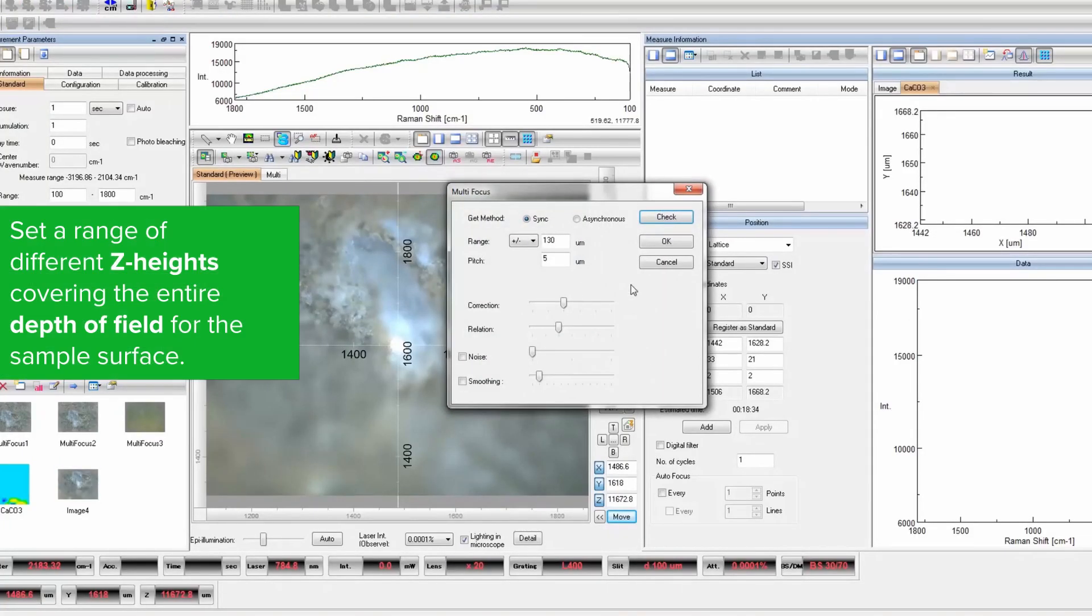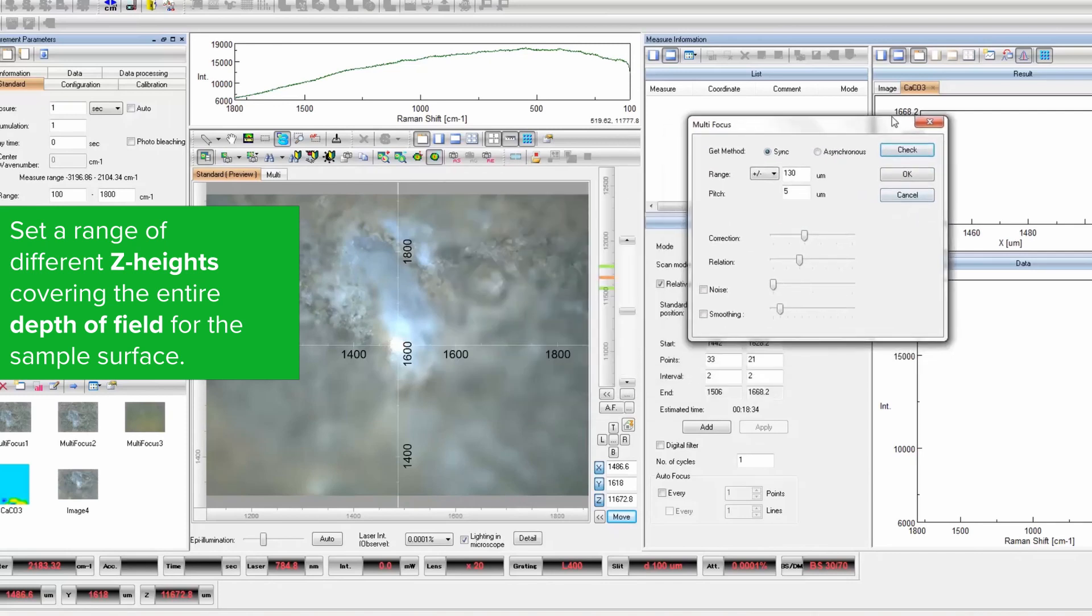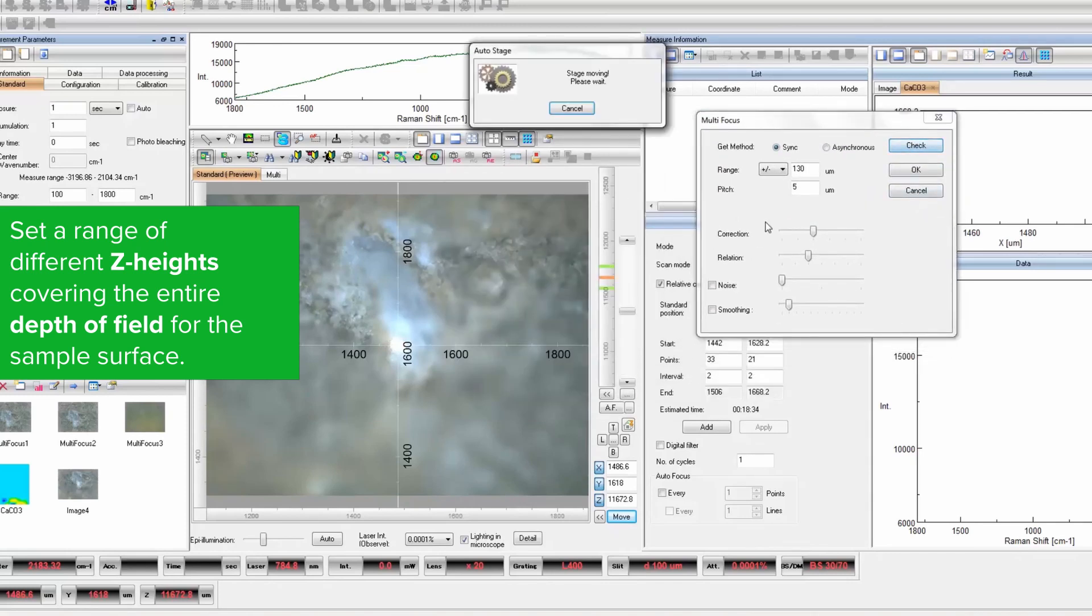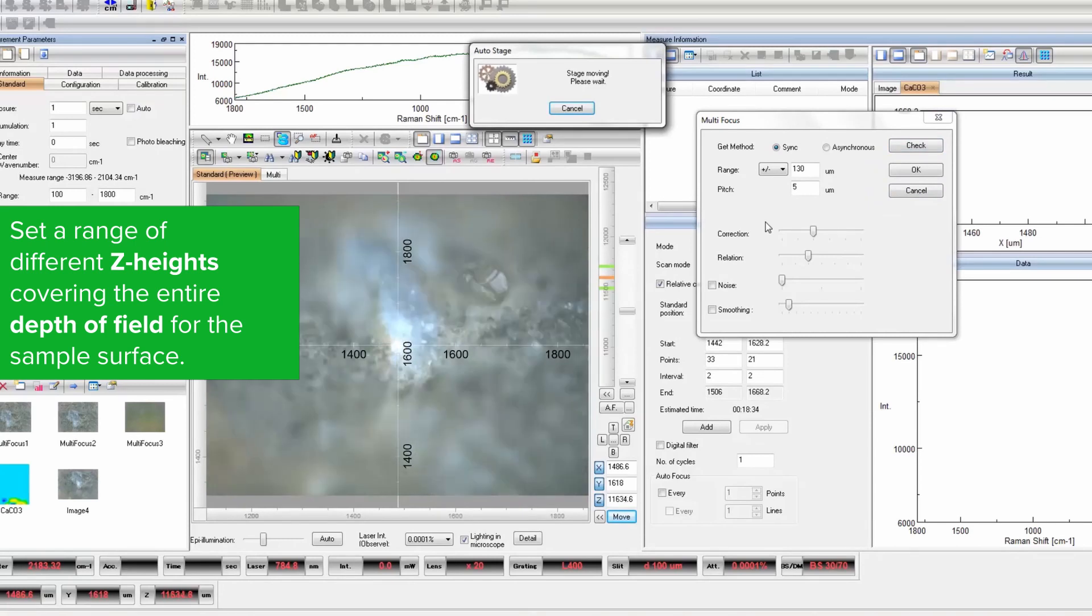Prior to sample measurement, it's important to take images of each layer through the sample to obtain multiple focal images.